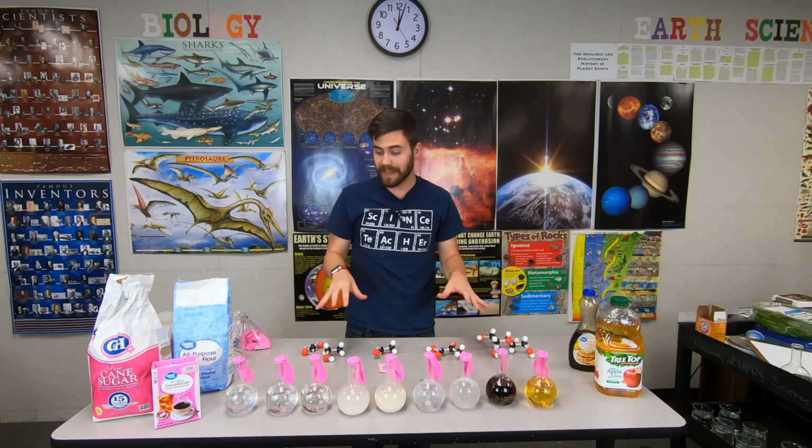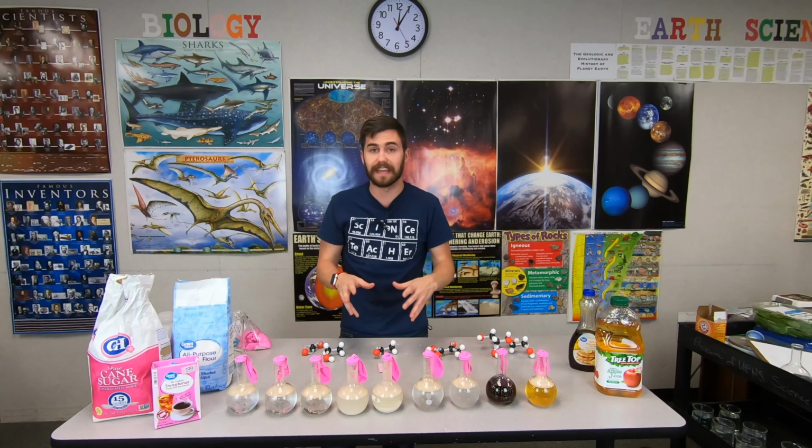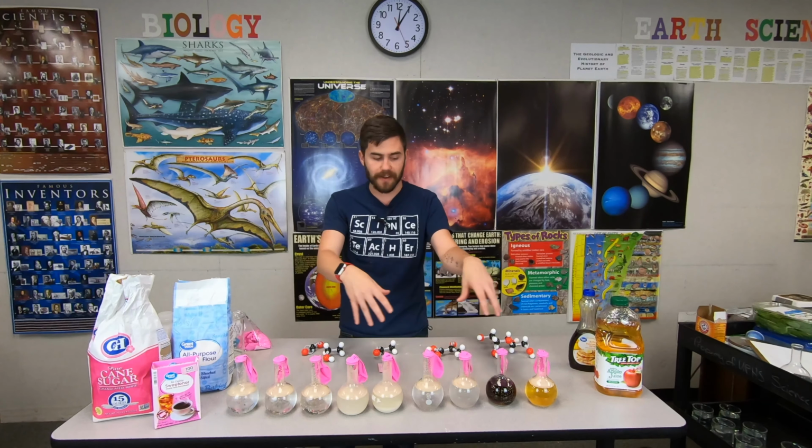So we need to swirl these again to make sure the yeast, it wants to float. We need to get it to the bottom. And as this experiment runs, periodically, I'm going to come over here and jiggle them a little bit to try to encourage as much fermentation as possible. So that'll all be in time lapse. Enjoy.